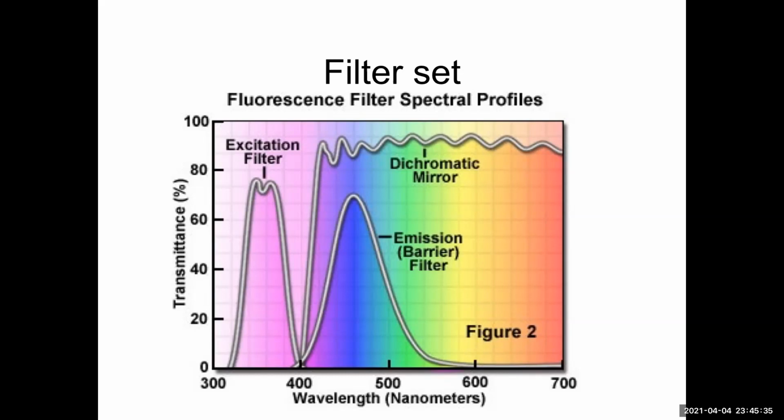They being the people who are selling you these filter sets or describing them or whatever. When you look up a particular filter set, you gotta look carefully and see, what does my x-axis say? What am I looking at here? There's two companies, Omega and Chroma, that sell these to microscopists. And they're both wonderful companies with good products.